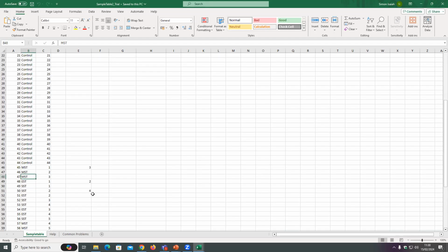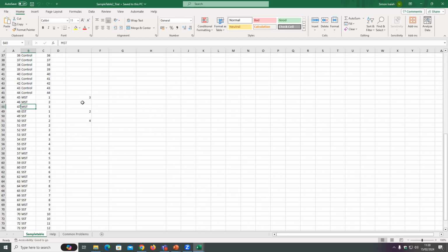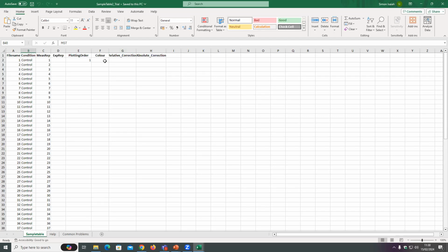As well, how I want the software to plot, when it comes to plotting order, which one should come first, which one second, third, fourth, and all that. For the color, it's just a choice, depending. So I said no, it's fine, the system can choose the color already. So I'm stopping sharing this.